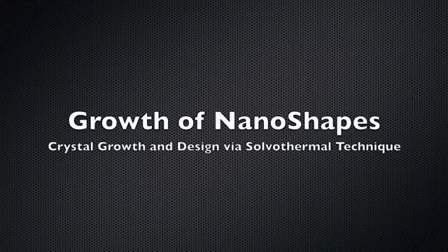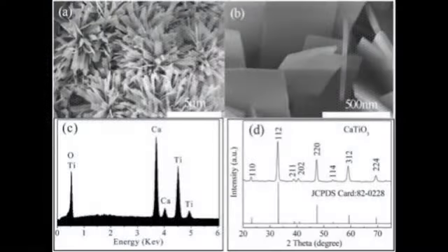In an independent research project, X-ray diffraction was used to analyze the growth patterns of nanoshapes such as nanospheres, nanocubes, and nanoflowers. In Figure A, we can see nanoflowers at a 5 micron scale. In Figure B, we see the exact same nanoflowers but at a higher magnification of 500 nanometer scale. These nanoflowers were grown using solvothermal techniques, and they were analyzed by electron microscopy and X-ray diffraction.